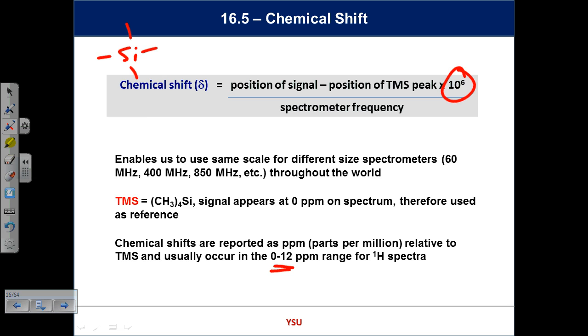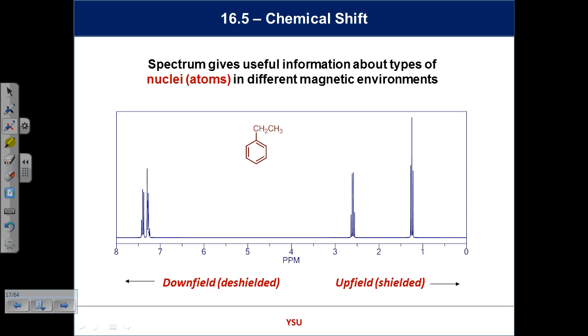Yeah, great. Okay, there's a typical spectrum. You will be expected to draw these things and to be able to analyze them to come up with a structure. And again, from now on, you won't be given any pictures. Your job is to actually come up with the actual pictures, the actual structures. We have some nomenclature right there. We've got something called a downfield shift and something called an upfield shift. And if you were looking for TMS, it would be right here. That's where the TMS signal will show, and everything else is measured to it.